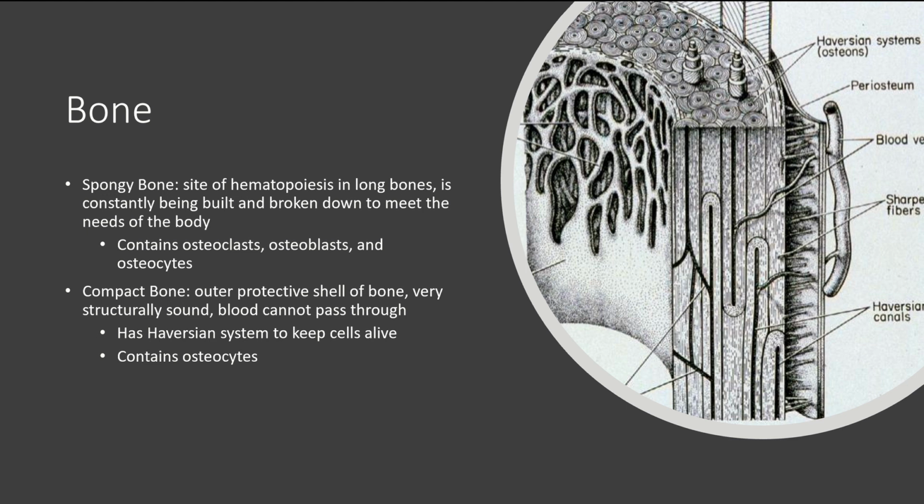Here, they're starting to swell up, right? They're taking up more room, getting bigger, getting more mature. That would be our zone of hypertrophy, so that's this zone right here. And then now you can see we're starting to eat away at all of that hyaline matrix, and it's being replaced by bone. So this zone right here would be our zone of calcification. That's where everything is finally getting ossified into bone, making that hard matrix that we'll cover in a second.